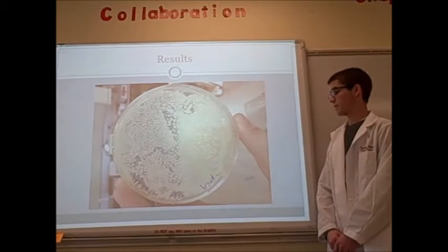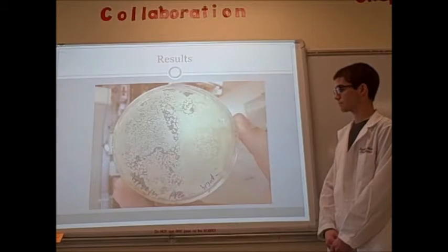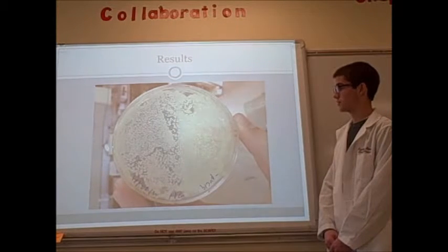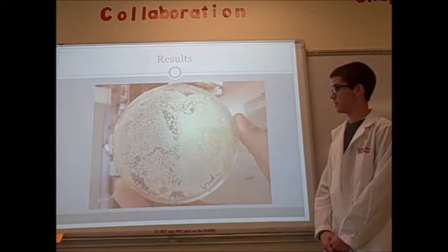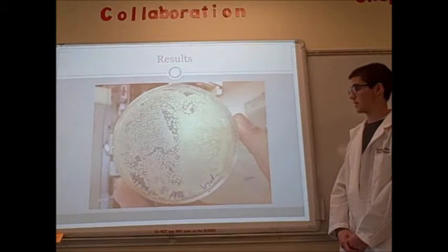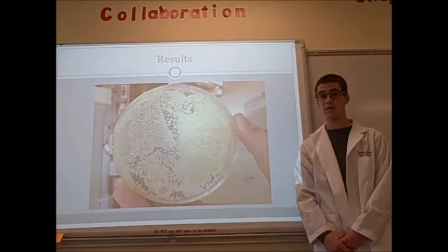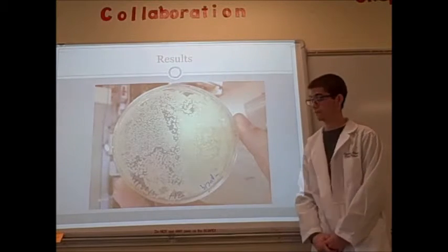This plate is the negative pUC19 plate, which was not transformed with pUC19 DNA, and it sports some growth in distinguishable colonies, but no blue colonies, which is expected as the bacteria did not contain any LacZ gene, which means they could not produce any beta-galactosidase.